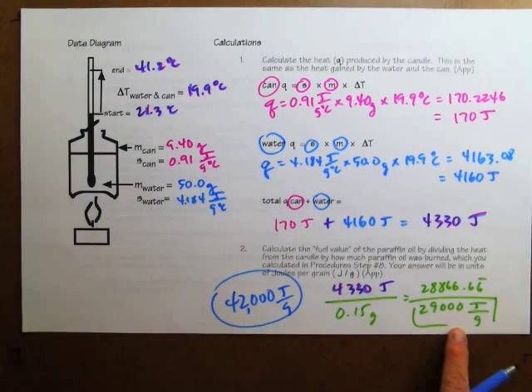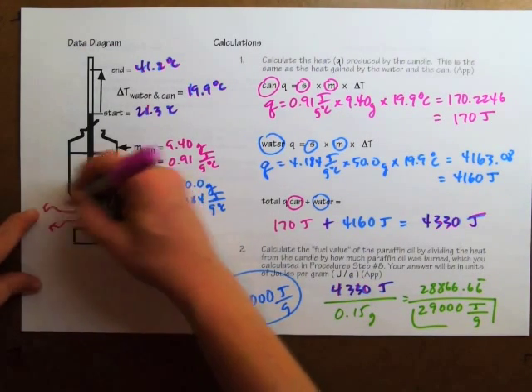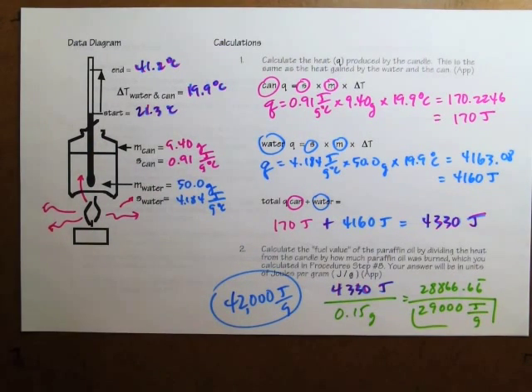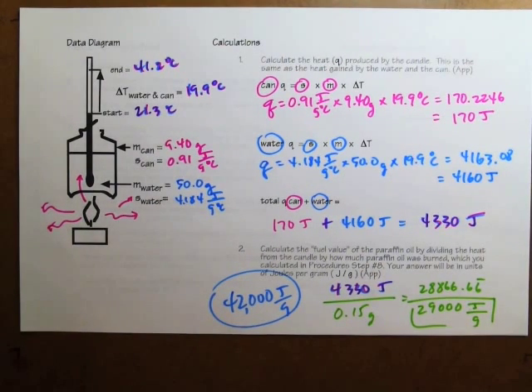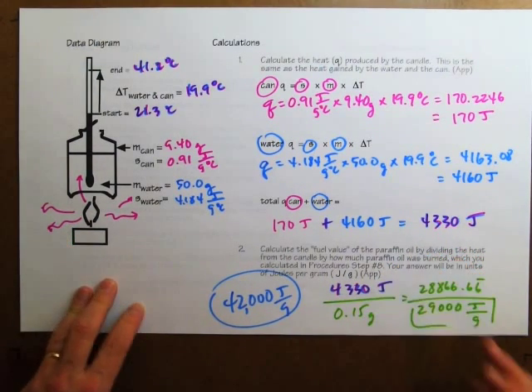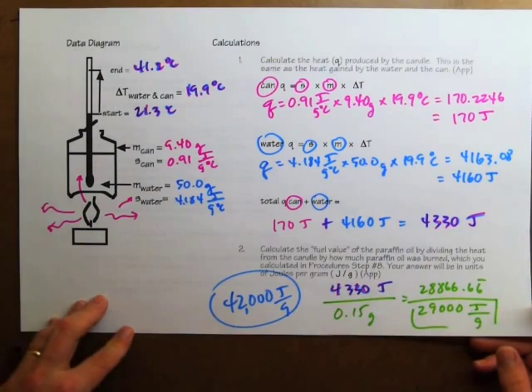Our results are considerably lower than 42,000 joules per gram because the heat from the candle is not all going into the calorimeter — a lot is going out into the room and we can't measure that. That's not a very accurate result, but since we know we were lower than we needed to be, in the next part of the experiment we can compensate by doing a calculation to create a correction factor. It's just like shooting an arrow at a target and coming up short — you know the next time how much harder to pull back or how much higher to aim.